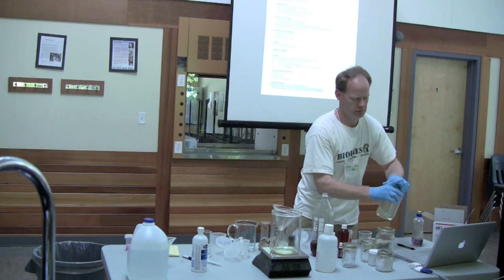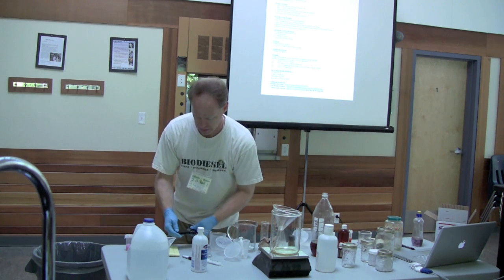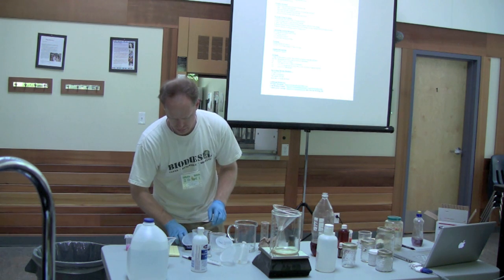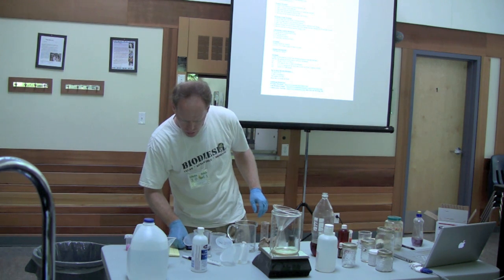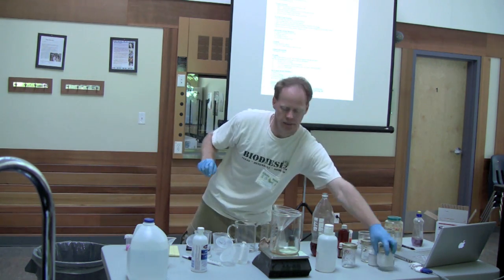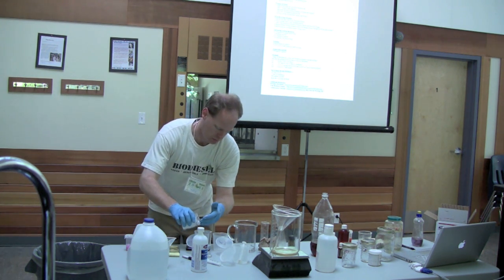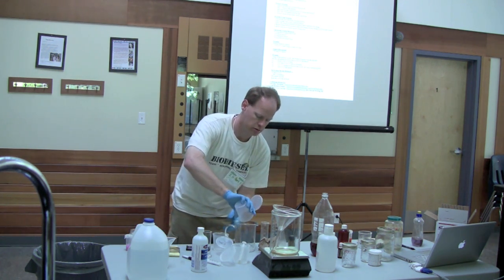I'm going to measure out 6 grams of potassium hydroxide. And the fun happens, because some of you guys get to participate. Okay, 6 grams. Perfect. There it goes.